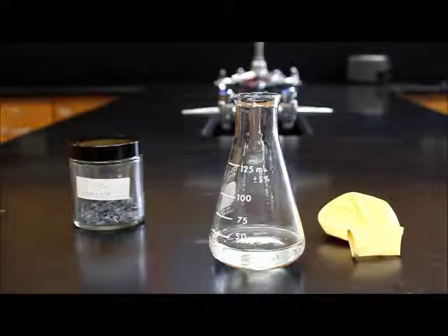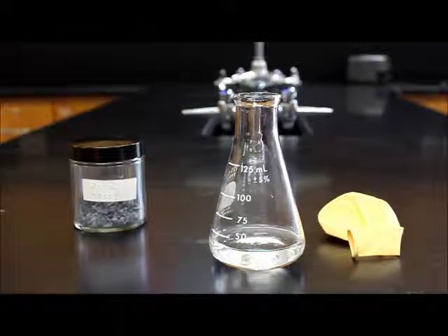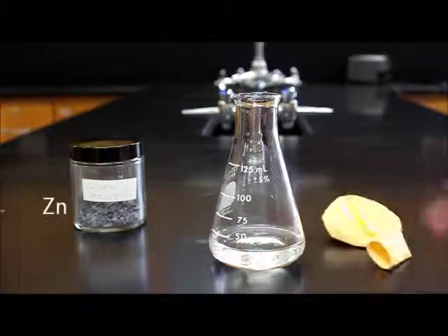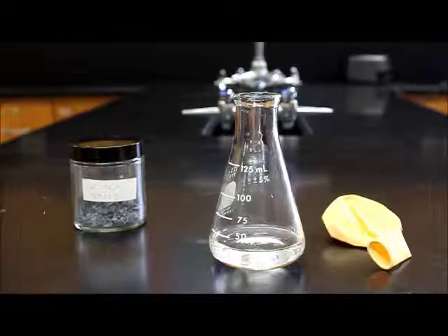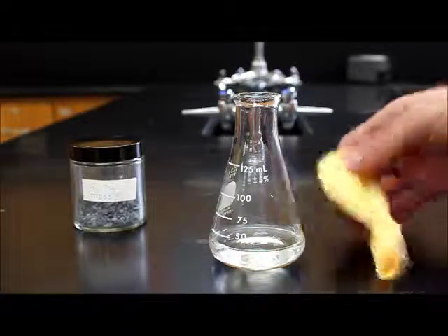Alright, now here are the materials that we're going to be working with for an experiment here. We have hydrochloric acid inside of a flask here. We have some mossy zinc, and then we have a balloon. What I'm going to try to do is use the reaction of zinc and hydrochloric acid to form zinc chloride and hydrogen gas. And what we're going to try to do is capture that hydrogen gas inside of a balloon here.